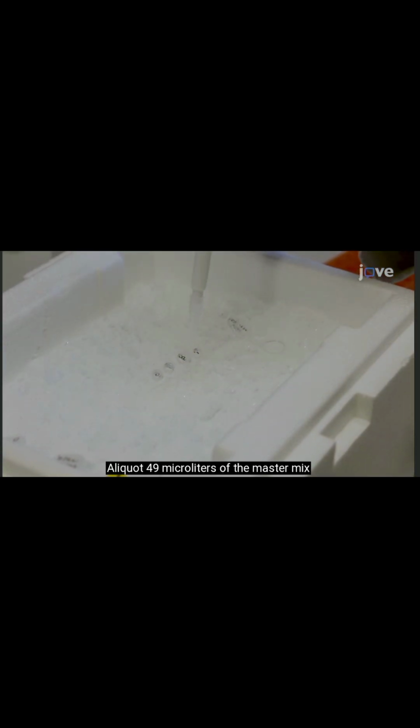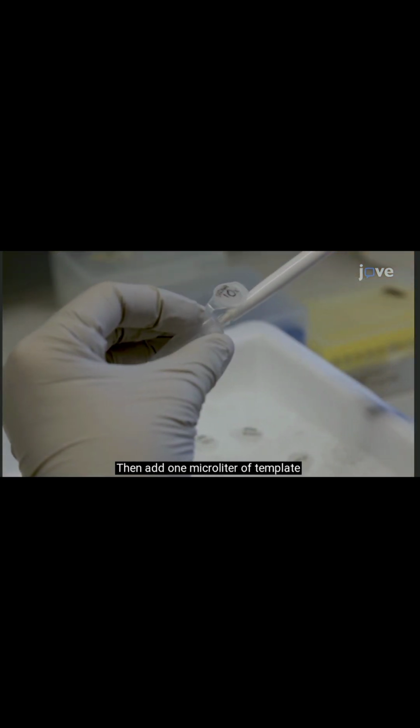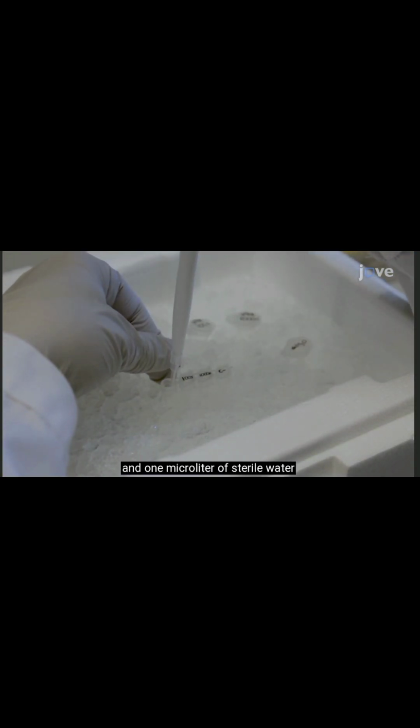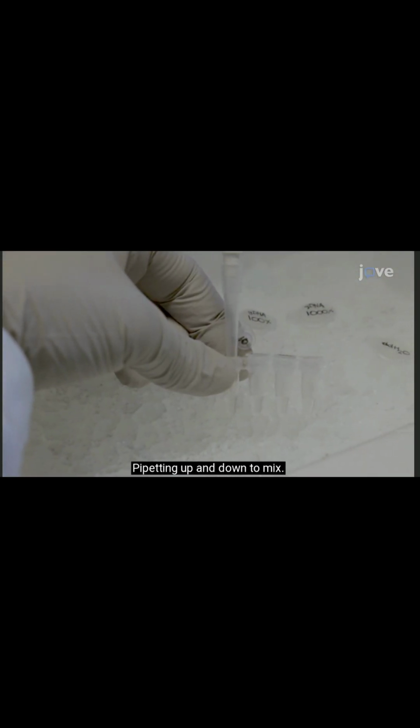Aliquot 49 microliters of the master mix into each of the PCR tubes. Then add 1 microliter of template to each of the experimental tubes and 1 microliter of sterile water to the negative control tube, pipetting up and down to mix.